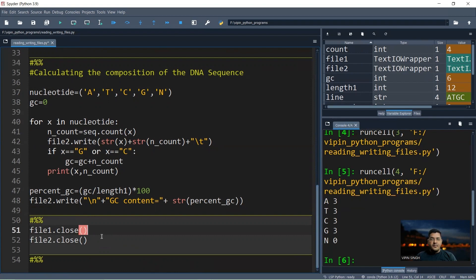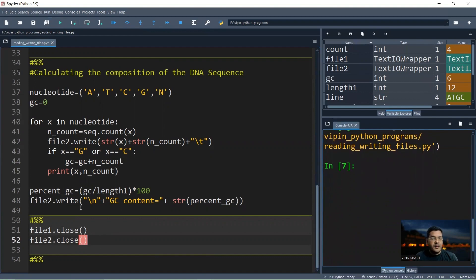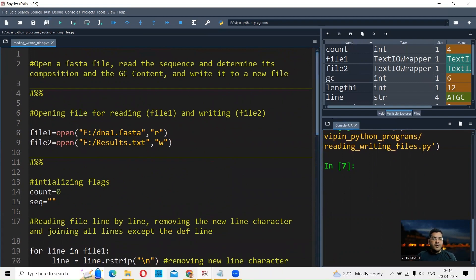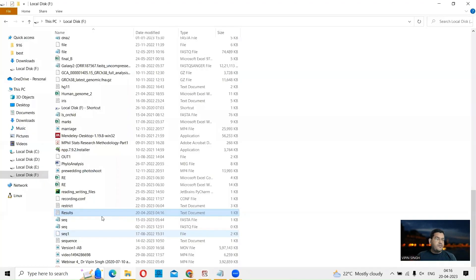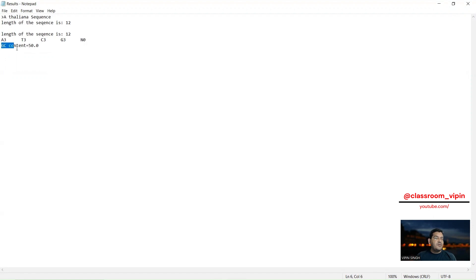Closing the files is important — otherwise the data you want to write to the results file may still be in the buffer. We run the final chunk. Then we open results.txt in the F drive to verify: the length of the sequence is 12, A=3, T=3, C=3, G=3, N=0, and the GC content is 50%.